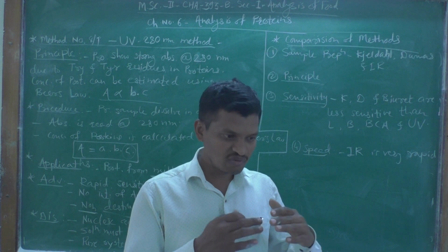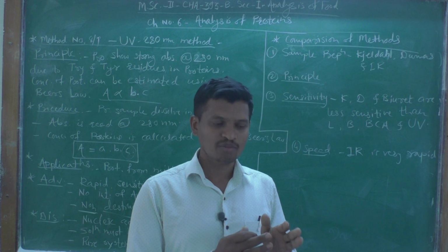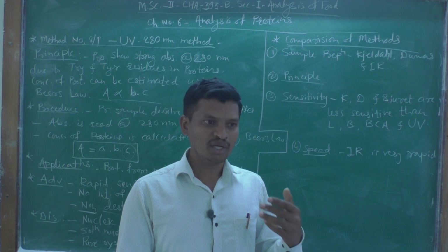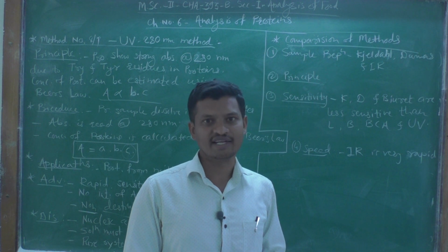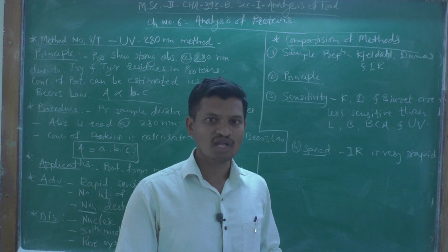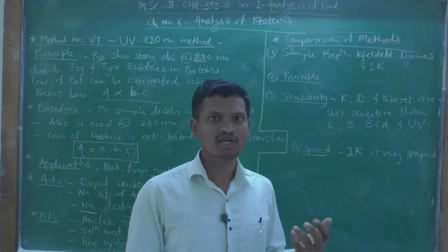We are converting the nitrogen content of that food sample into dinitrogen along with the nitrates and nitrites. Mind well, that's why the Dumas method gives a somewhat larger value as compared to Kjeldahl, Lowry, BCA, etc.